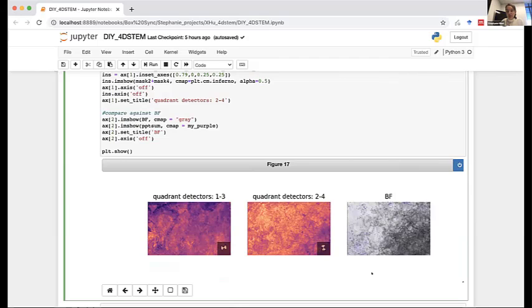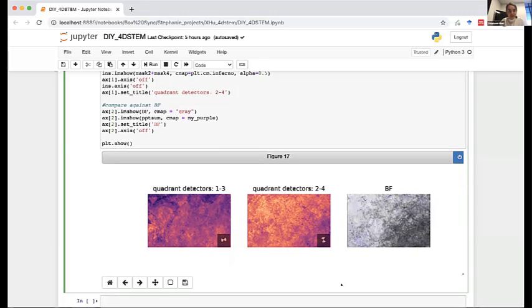And this is starting to assess different types of fields within our sample. Based on the information we know about the sample, we assume that this has a lot to do with strain fields, but this is a good starting point for doing some further analysis, combined with the rotational information from before, to assess strain in this type of sample. So that's all I had to share. I hope that I've convinced you that coding in Python is fun and easily accessible and very useful for analyzing your specimens. And I guess we'll see if there are more questions now.